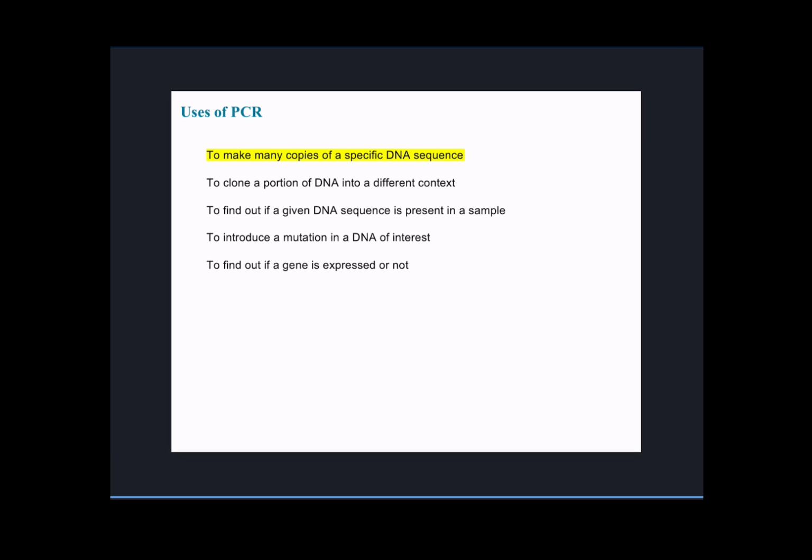So we left off at a conversation about how PCR can have several uses. In fact, when I asked what we use PCR for, I heard some of the ideas that are listed on the screen now. But we also emphasize that PCR as a molecular biology technique is just a protocol or a procedure by which we can get many copies of a specific DNA sequence, right? And of course, having many copies of a specific DNA sequence can be useful in a number of ways, and that's what we'll do today.